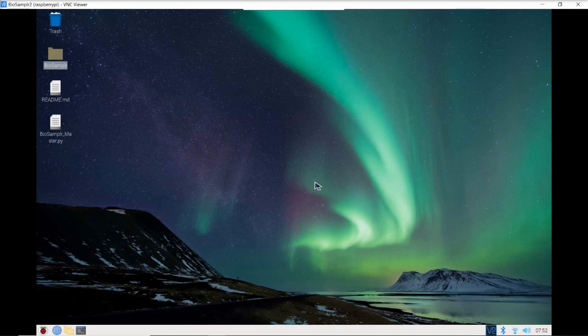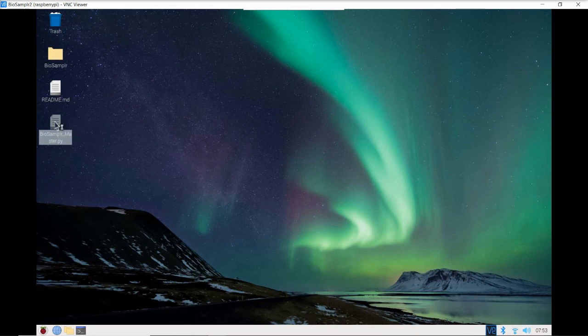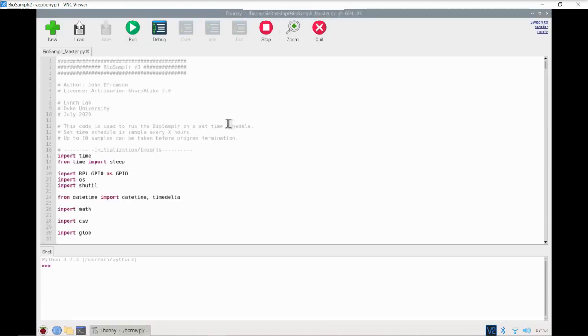In the last couple sections we went through the assembly process. If you have not seen those videos, maybe take a look at those before continuing. We are going to first take a look at the master script, and then we're going to go through some test files that help calibrate and make sure everything's working for the instrument.